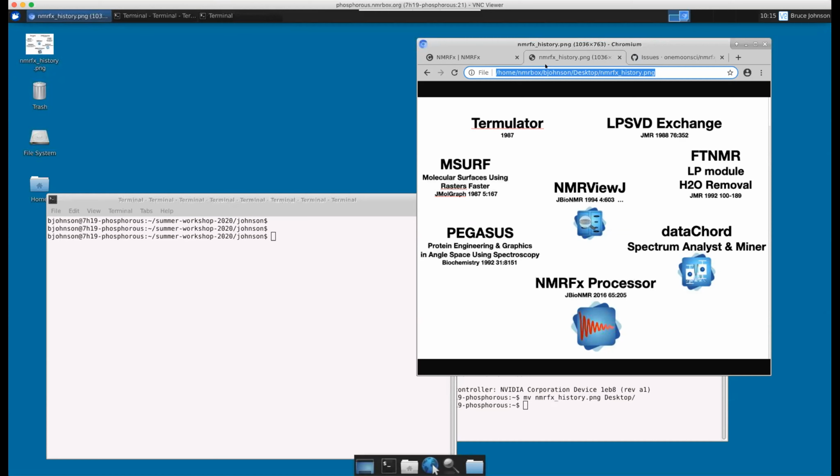But it's also a testament that there's so many choices of programs to run, etc., that it can be a little bit overwhelming. So we had the idea of coming up with what I sometimes refer to as sort of soup to nuts, one sort of integrated package to get you from raw NMR data to a structure or titration analysis, etc.